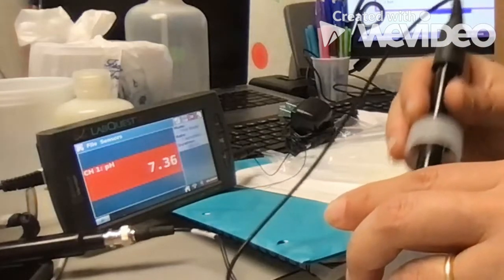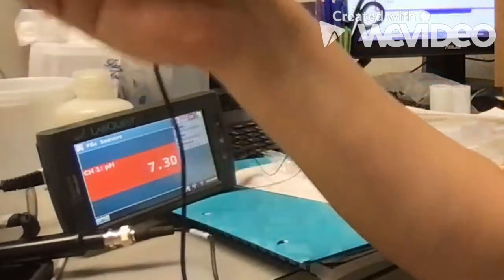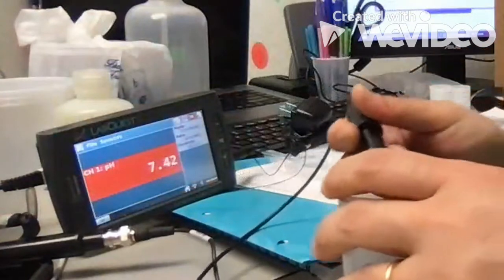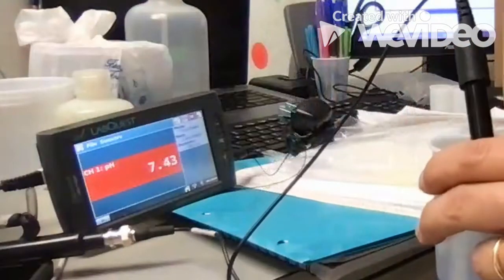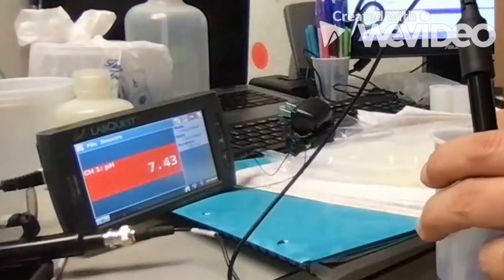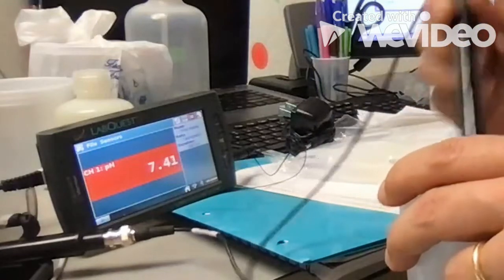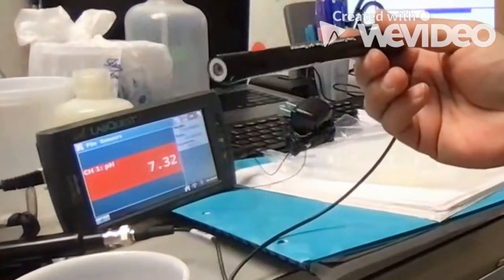And that doesn't seem very accurate here. Let's see, maybe, oh boy. I'm going to add some more ammonia in here.